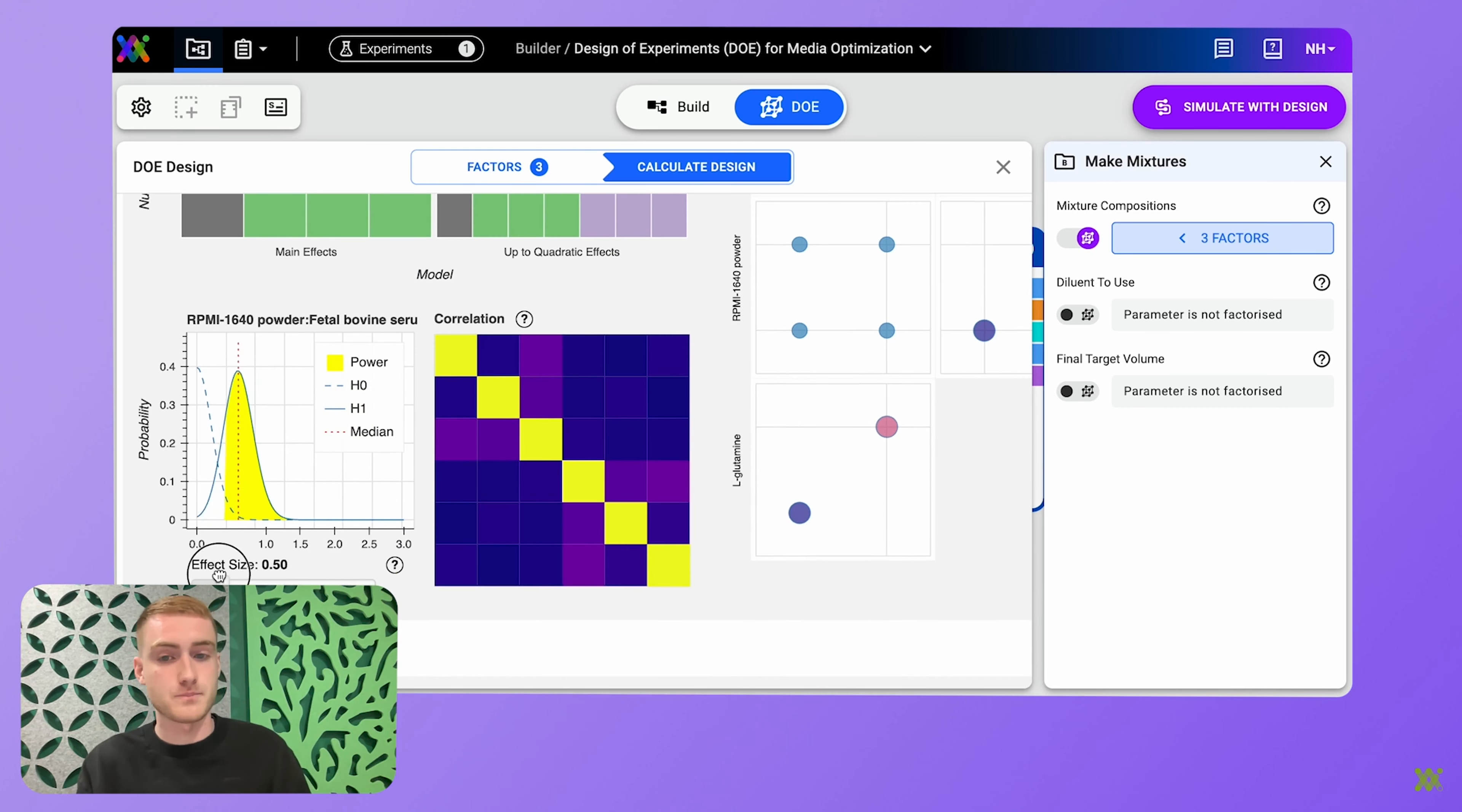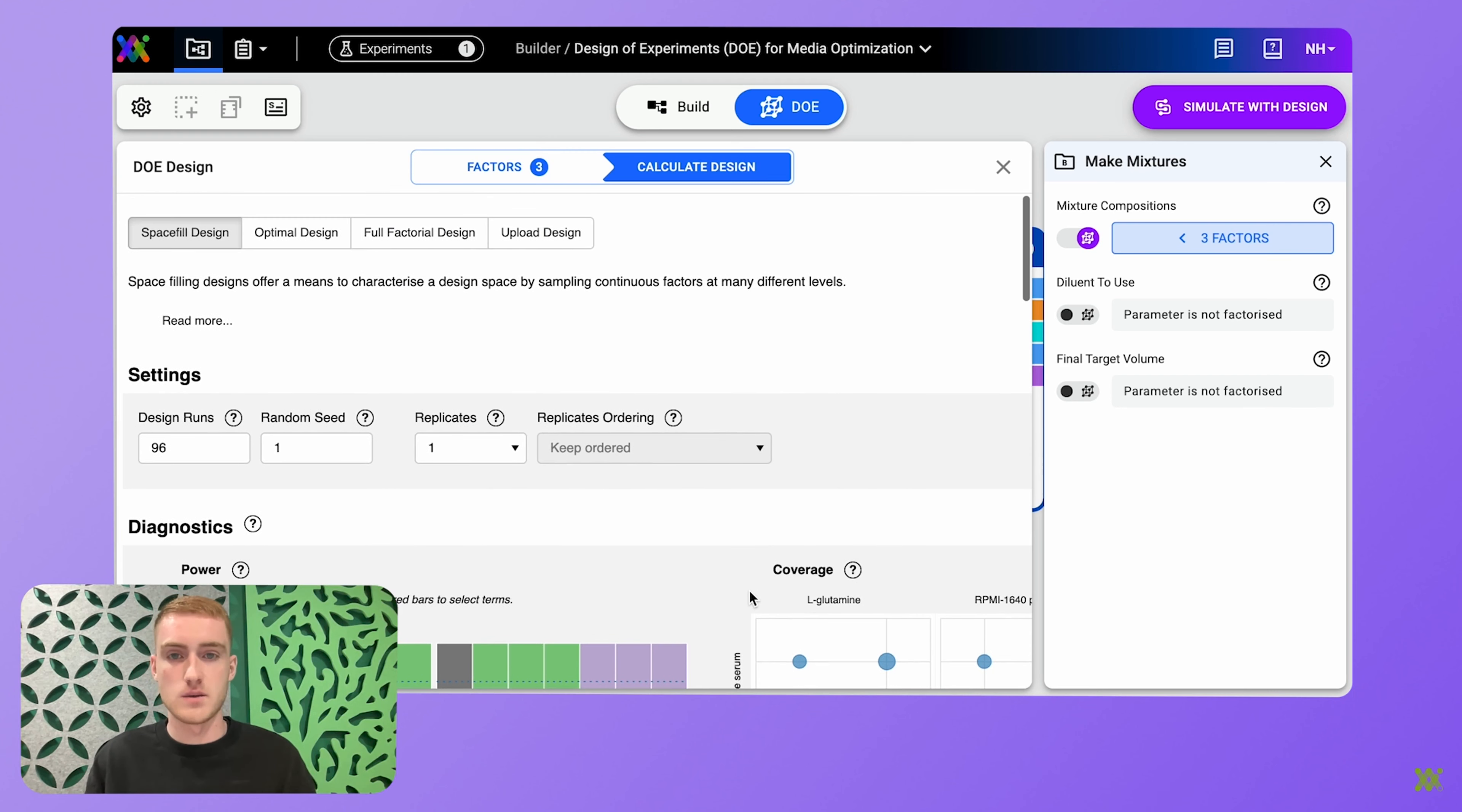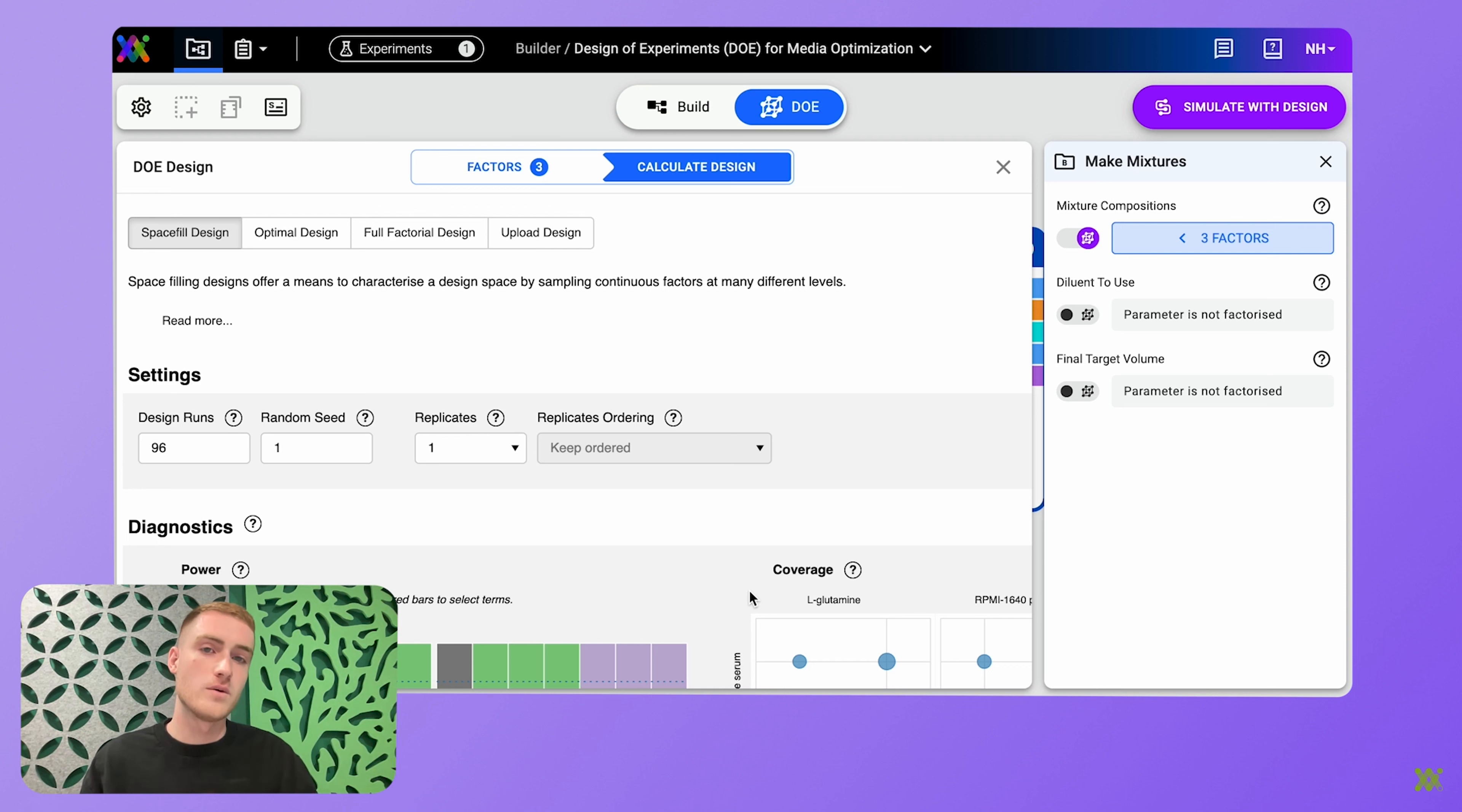Irrespective of your prior DOE knowledge, you're presented with three design options and you're told how powerful those DOE designs are. So you're not just giving DOE a go, you're able to create powerful experimental designs.